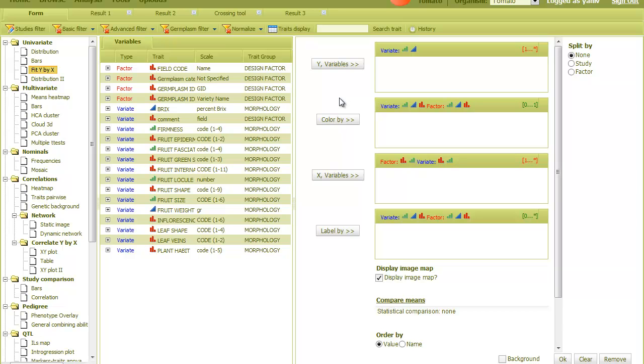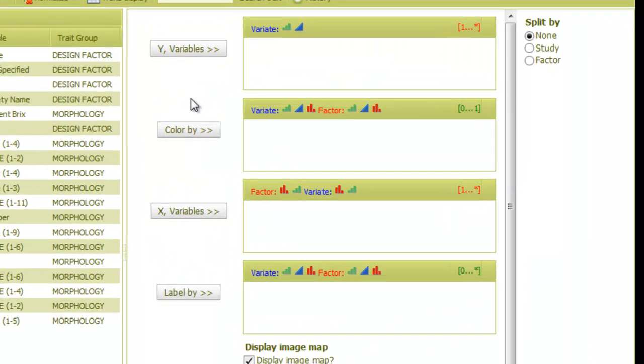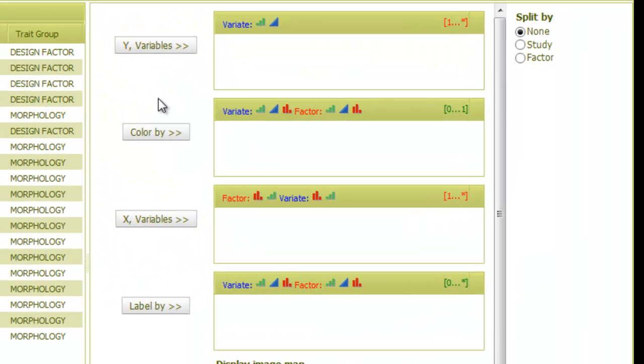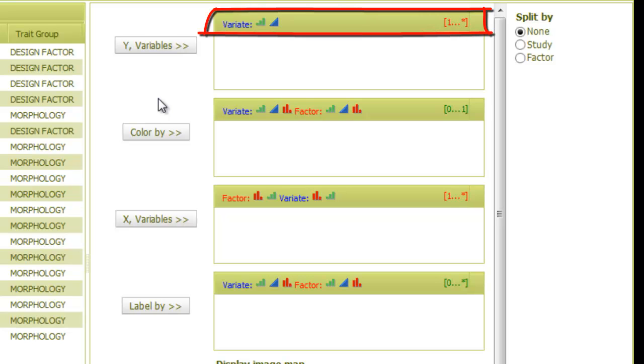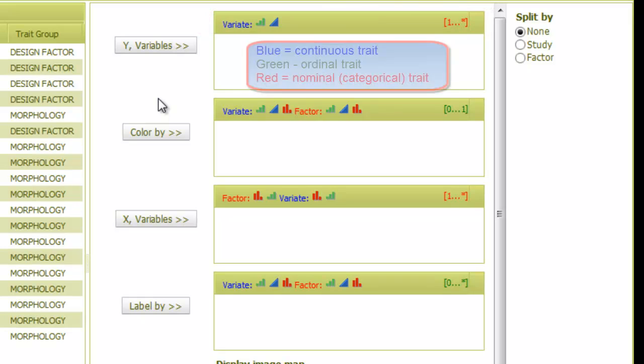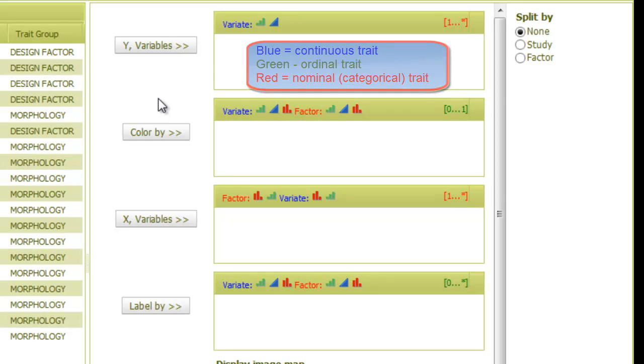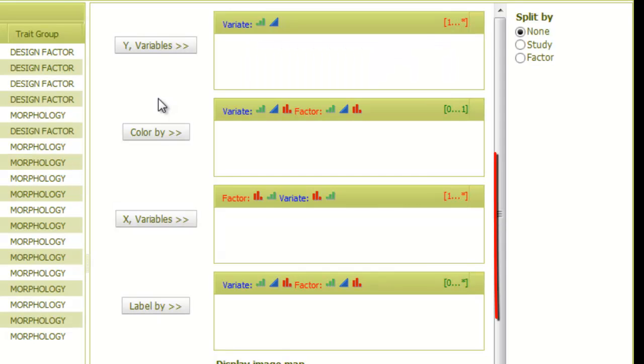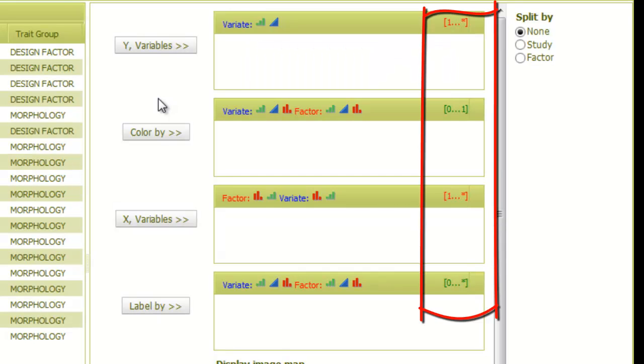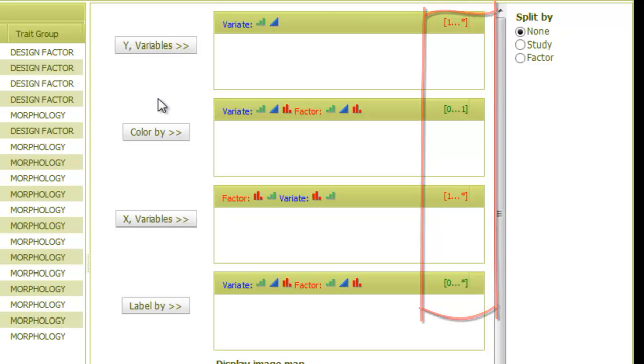The fit Y by X analysis has four fields. The title of each field shows the type of traits it can get. Blue is a continuous trait, green is ordinal, and red is a nominal trait. On the right, we can see how many traits the field can have. The first number is the minimum number of traits, and the second is the maximum, where an asterisk means that the number of traits is not limited.